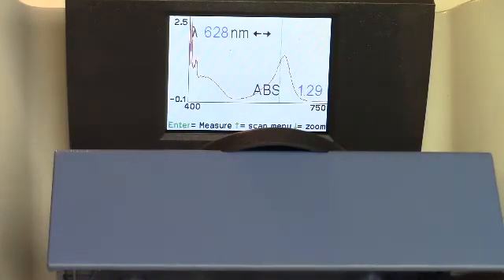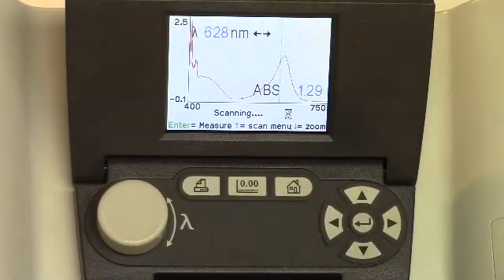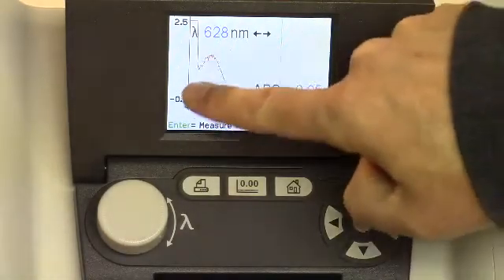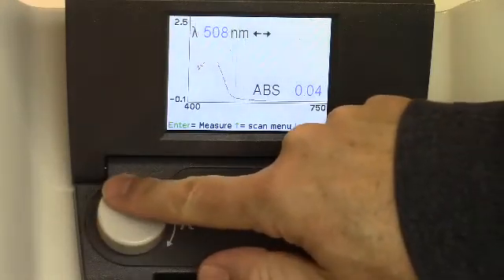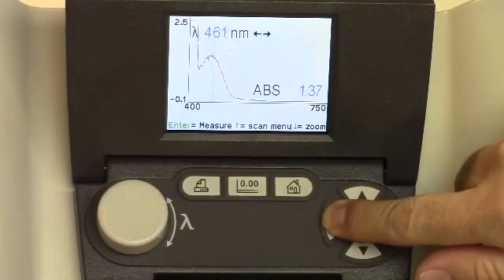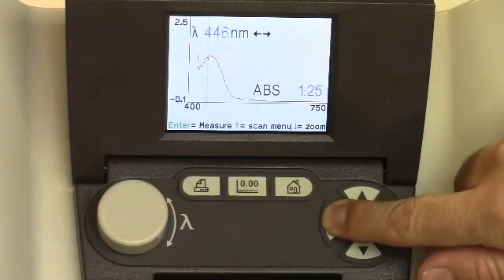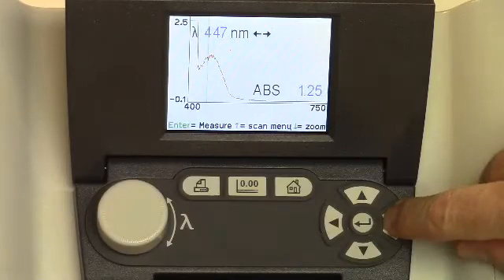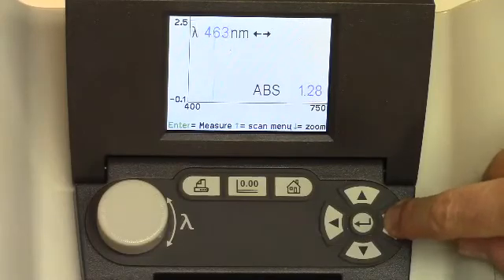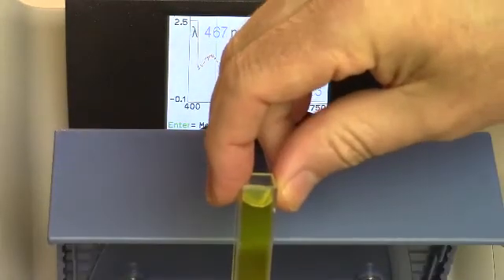We're going to do a yellow sample next. Yellow does some weird things. You'll see. But this has a very different absorbance spectrum. These are absorbance spectrums. And so nothing up here, just one big absorbance down at this end. So let's dial it down there. And we'll just scan through. We're just going one nanometer at a time. I don't know why I just had this thought of the old painter guy, Bob Ross. Happy little nanometers. And so there's your scan across that. So you can record that wavelength with maximum absorbance. That was a yellow sample there.